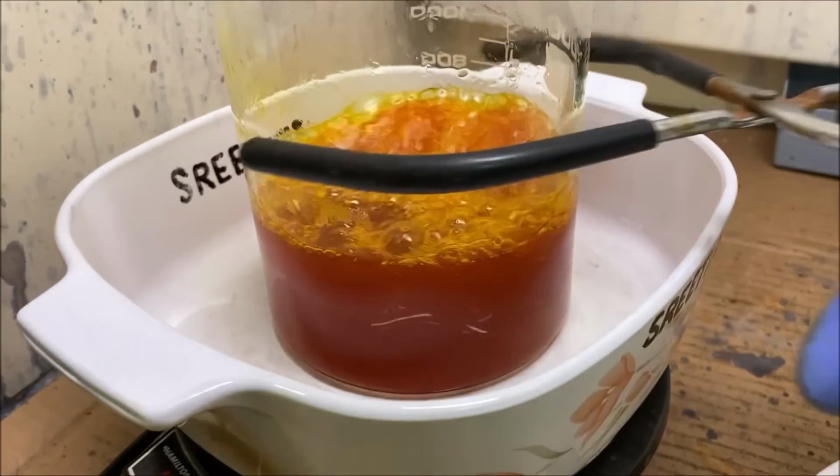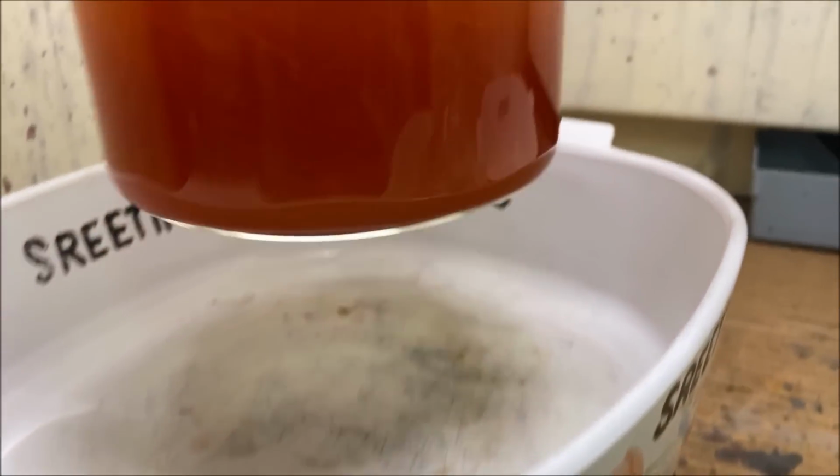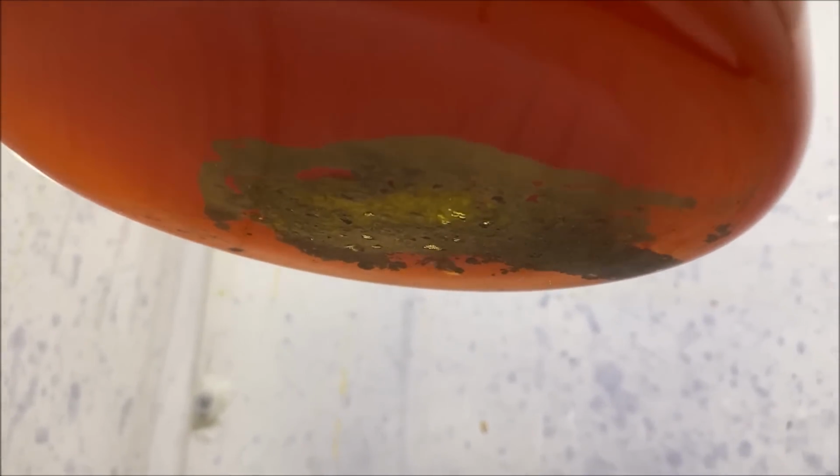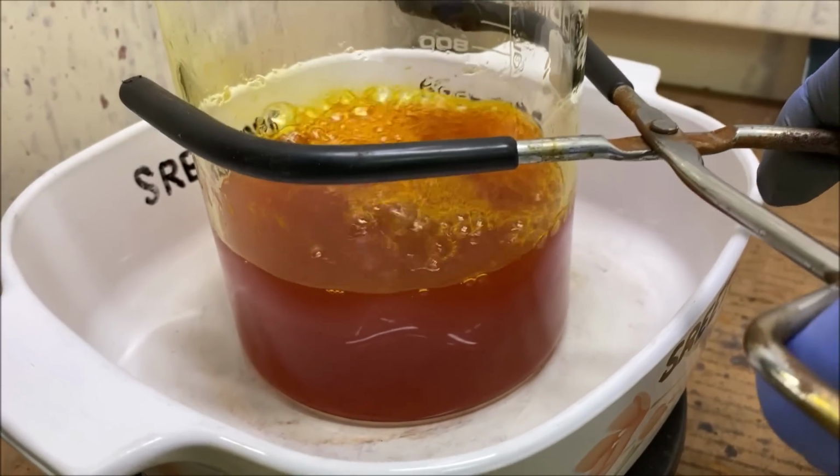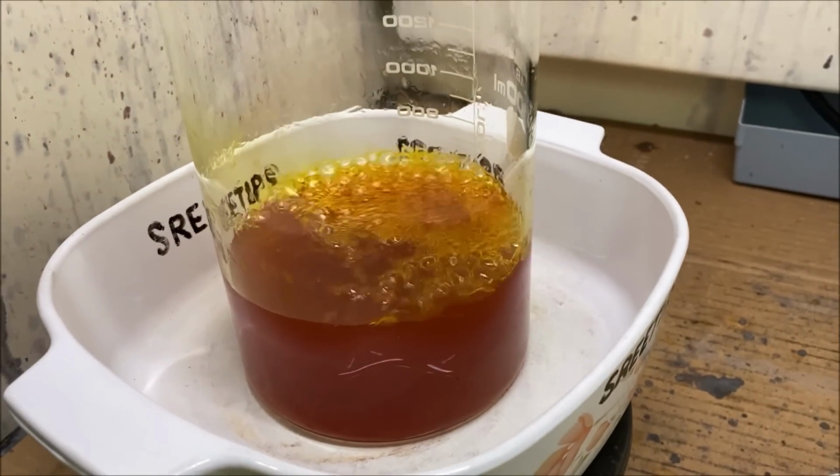All right, this has been boiling now for about 10 minutes. You can see we still got some gold that needs to dissolve. So we'll add a little bit more nitric acid in here to see if we can get the rest of that to go in solution.